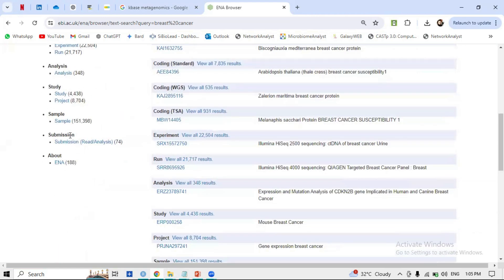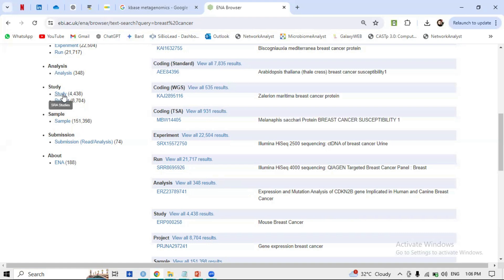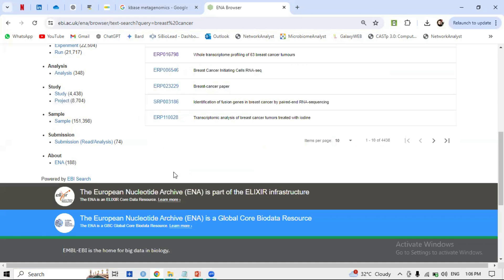When searching for breast cancer, about 4,438 studies and 8,704 projects have been conducted, with over 151,000 samples generated. This is the combined result. We need to search specifically for our RNA-seq files, so we will start from the Study section. Click on 'Study' and check what type of studies have been conducted.